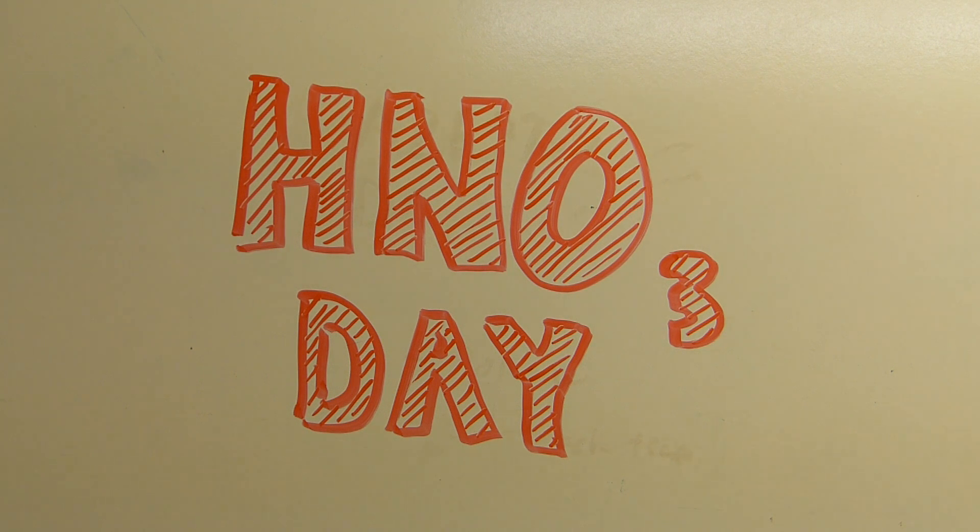Nitric Acid Day, of course, if you haven't guessed, occurs on the day in which my laboratory runs out of nitric acid, and that happens to be today. The reason I don't like making nitric acid is not because it's an overly complicated synthesis. It's just that it's so simple, and it's boring, and I've done it a million times. But maybe you haven't seen it before, and maybe you'd like to know how to make some nitric acid, so I decided to show you.